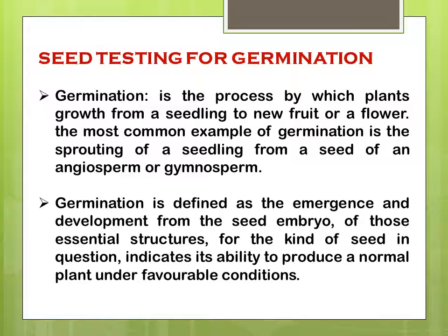Suppose you have purchased seed or procured it from different markets, a seed agency or a certified seed agency, and under favorable conditions the seeds are not able to germinate. It means your seed lot is not good. Your seed is either in a dormant period or maybe dead. So that's why the germination test is very important.